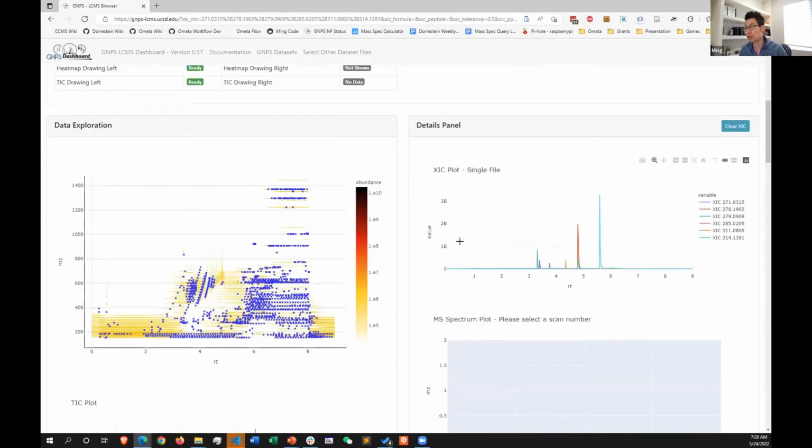And so what you can do that makes it nice and easy to do is if you put controls in all your samples, or if you just have QC runs with a QC mix, you can set presets for your extracted ion chromatogram, and you can inspect what's going on really, really quickly across a bunch of your samples.